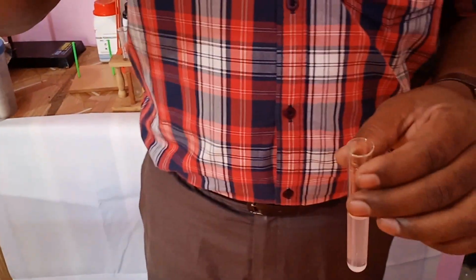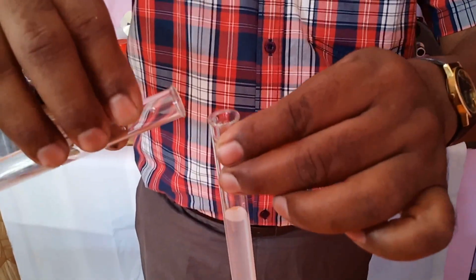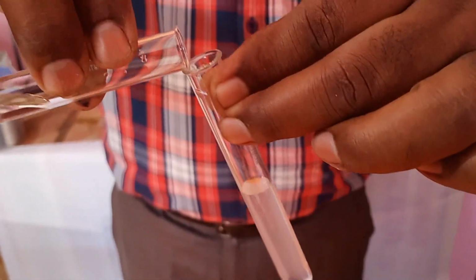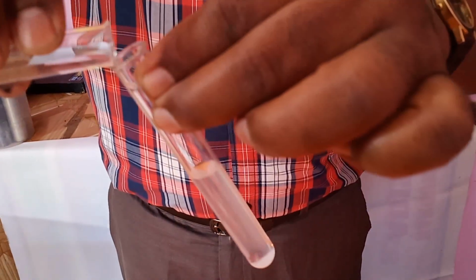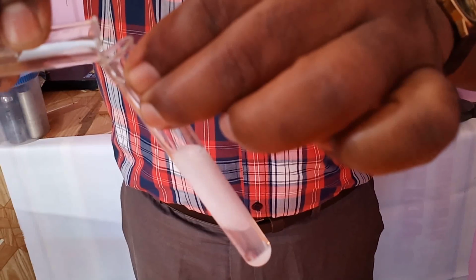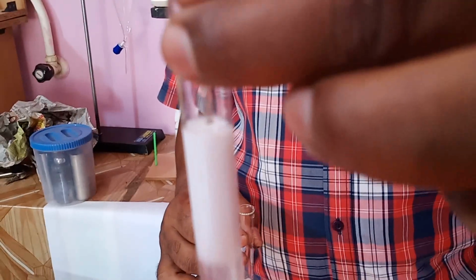Now I'm going to slowly add this sodium sulfate into this barium chloride. Let's see what happens. You can observe, slowly I'm adding it, drop by drop. You can see that a white precipitate is formed.